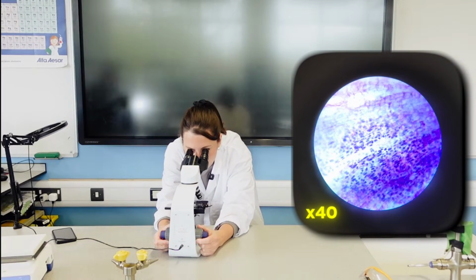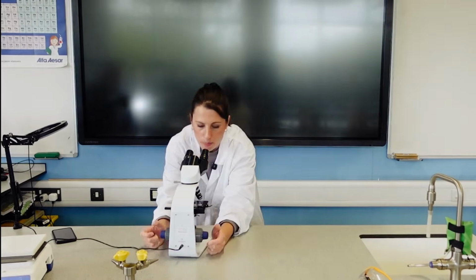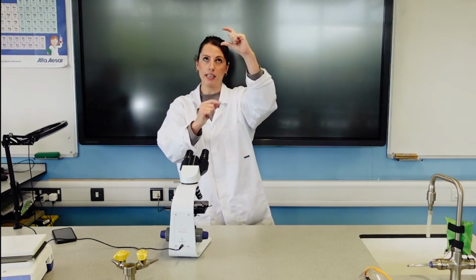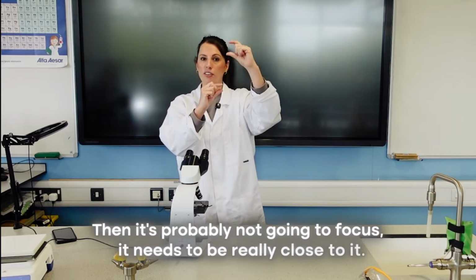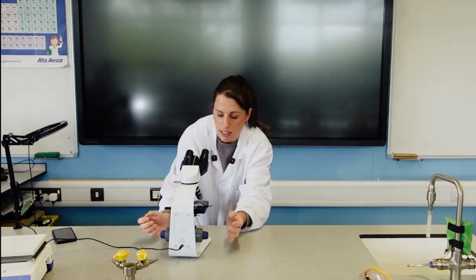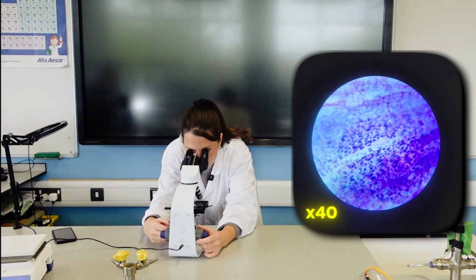If students are struggling to get it to focus, generally speaking, it pops into focus when the lens is very, very close to the slide. So if there's a big gap between the lens and the slide, then it's probably not going to focus. It needs to be really close to it. But as I said, check that they don't then move it all the way down and it crushes and smashes the slide. So this is now in focus, and I can see cells.